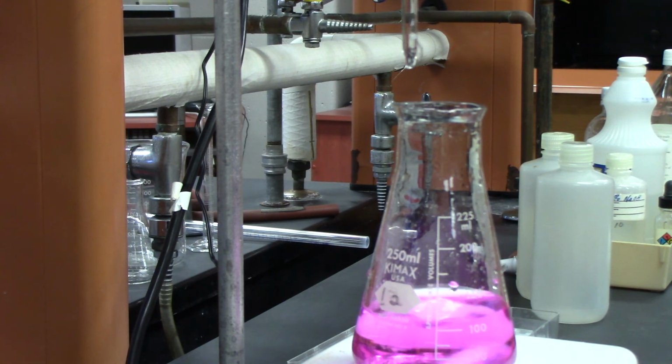Okay, so what you want to do is have your initial volumes for the two experiments. For the first experiment, you're going to want to have the mass of your KHP. There were two experiments for part one, and you're going to average the two. For each one, you're going to have a mass of your KHP, an initial volume, and a final volume of your sodium hydroxide. Then you're going to take the difference between the initial and final, and that'll be how much volume you added to the KHP to neutralize it. And then you're going to do that for the second one as well.